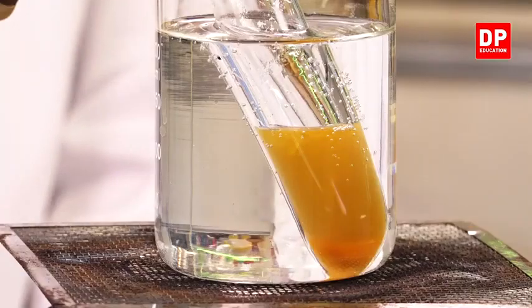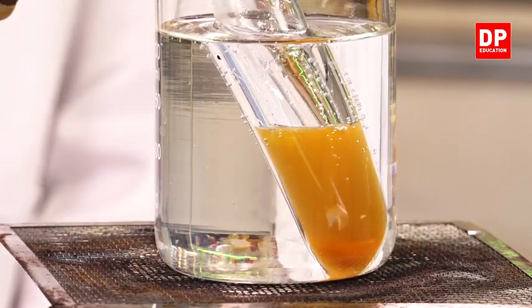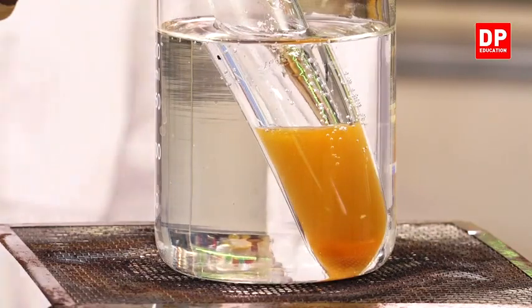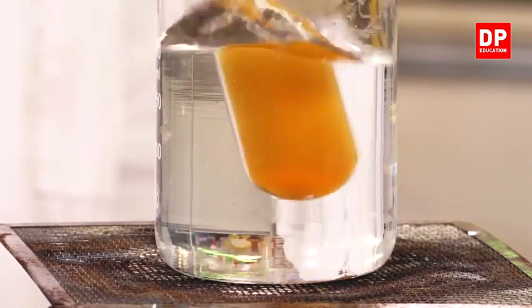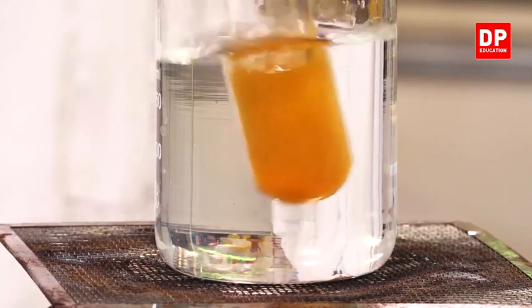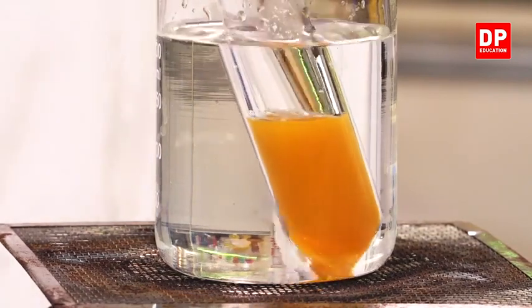Now students, you can see the color changing from yellow to orange. If I mix the solution properly, the reaction will take place more uniformly.